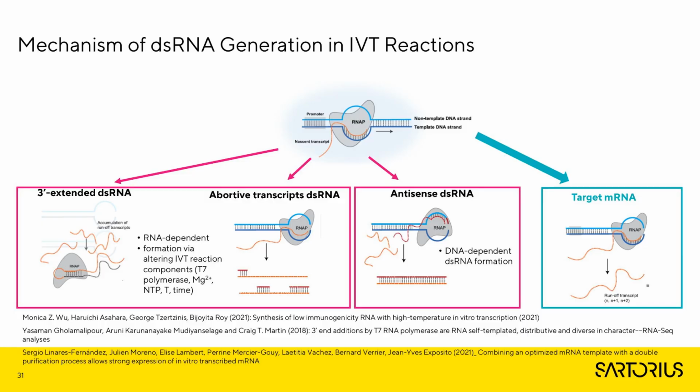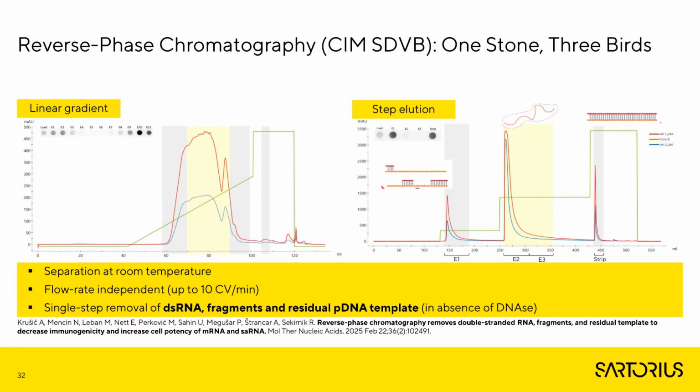And here, let's say the traditional, highly reliable tool is reverse phase chromatography. And we have done a nice study that rebuked some of the myths about reverse phase chromatography, meaning which stated that it's not scalable and that it's low recovery. We've shown that neither of those two things are true.